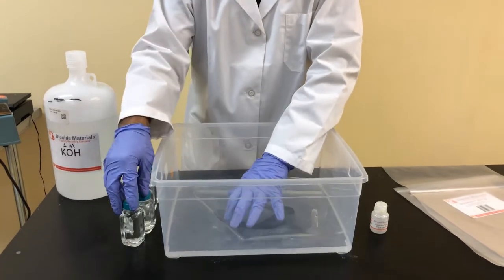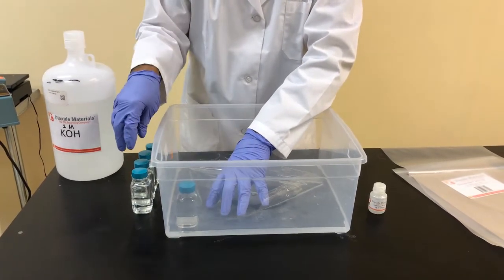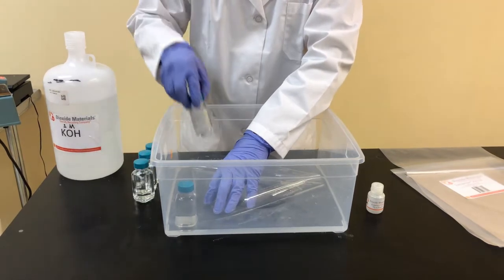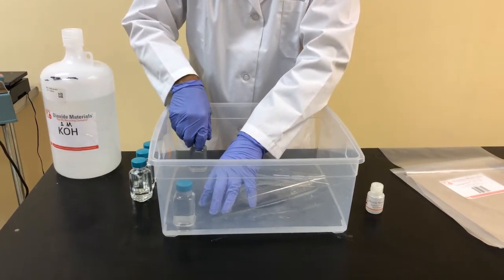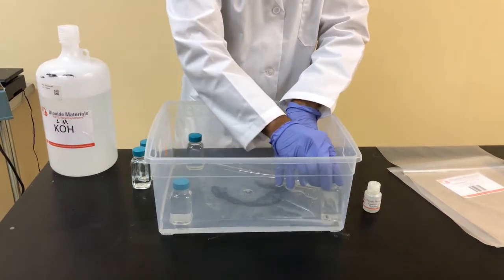Now we're simply going to put glass bottles as weights on the corners to ensure that the membrane stays immersed in the KOH bath — one molar of KOH — for at least four to five hours.